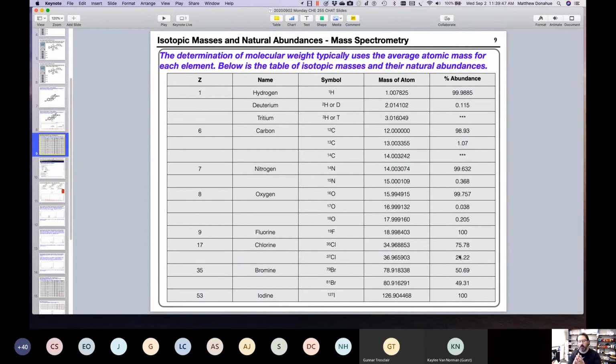Just type in some numbers in the chat box. It's 3 to 1. So I'm going to show you this visually, but I'm just going to explain it now. If you have a piece of data and the parent ion shows a peak with a ratio of 3 to 1 at the parent region, you should know, okay, by this table, that molecular formula has chlorine.